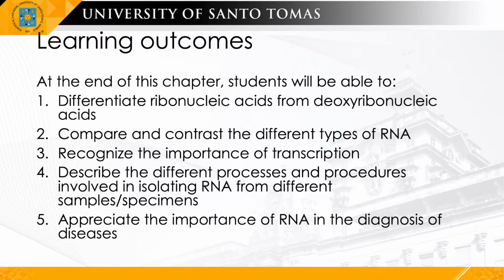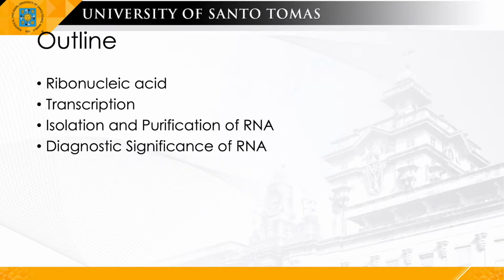Today, our focus will be describing the different procedures involved in isolating RNA from different samples or specimens, and of course, appreciate the importance of RNA in the diagnosis of disease. So the outline for today: we're going to have a brief overview of what RNA is, its role in transcription, the isolation and purification of RNA, and its scientific or diagnostic significance in the clinical setting.